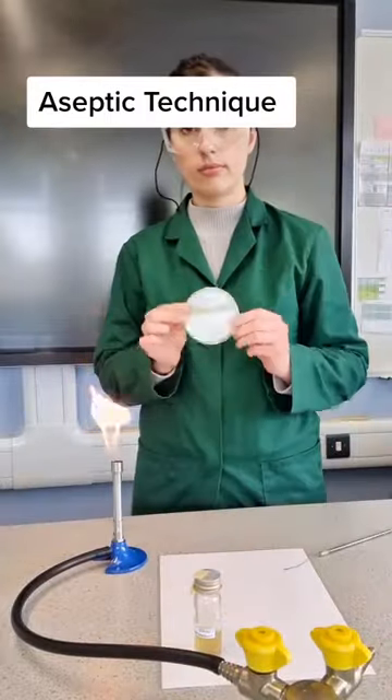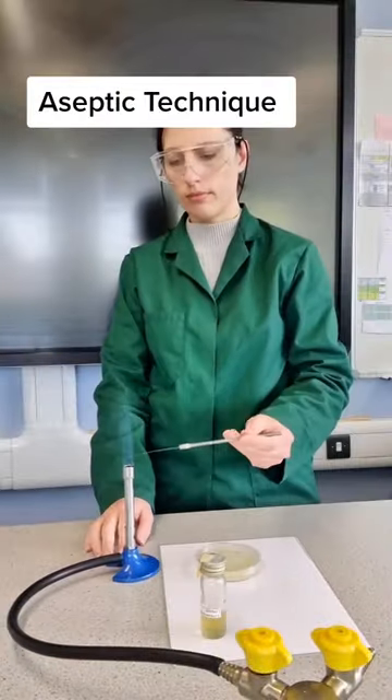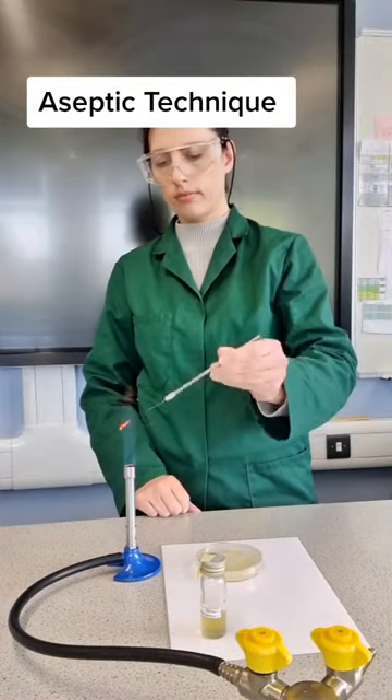Here's the aseptic required practical for GCSE and A-level. I'm going to be sterilizing my equipment, and when you sterilize, use the top of the Bunsen because that's the hottest point.